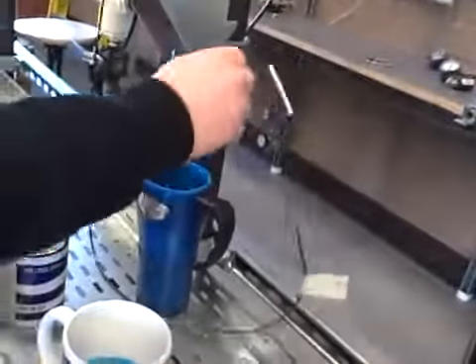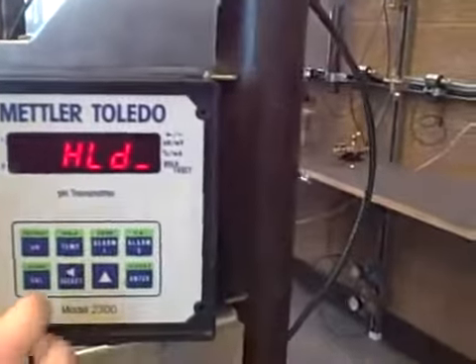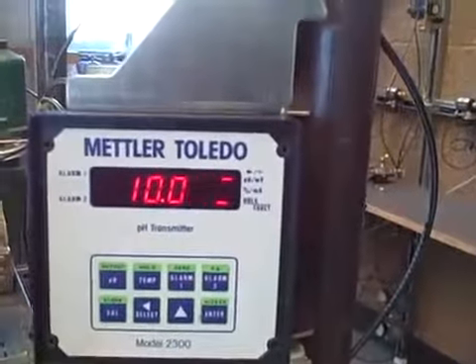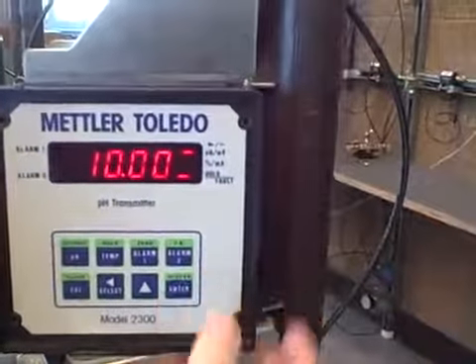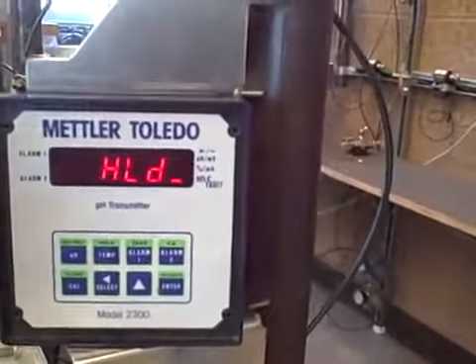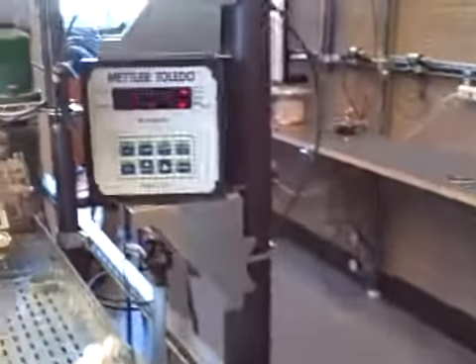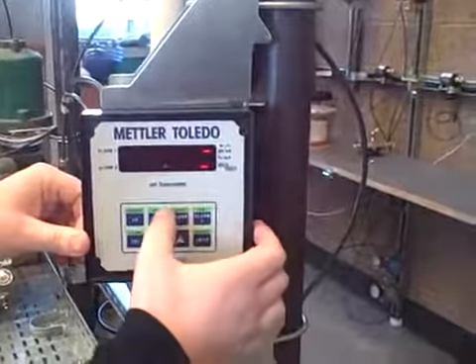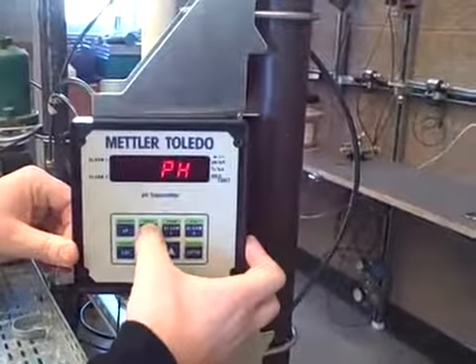I am going to clean the rod off and place it in the second buffer zone. I'll push the calibration key again and tell the machine this is a pH of 10. I'm going to push enter once, and after doing that I've told it two test points, and from there I can calculate the rest of the values. And that's that — it's calibrated.